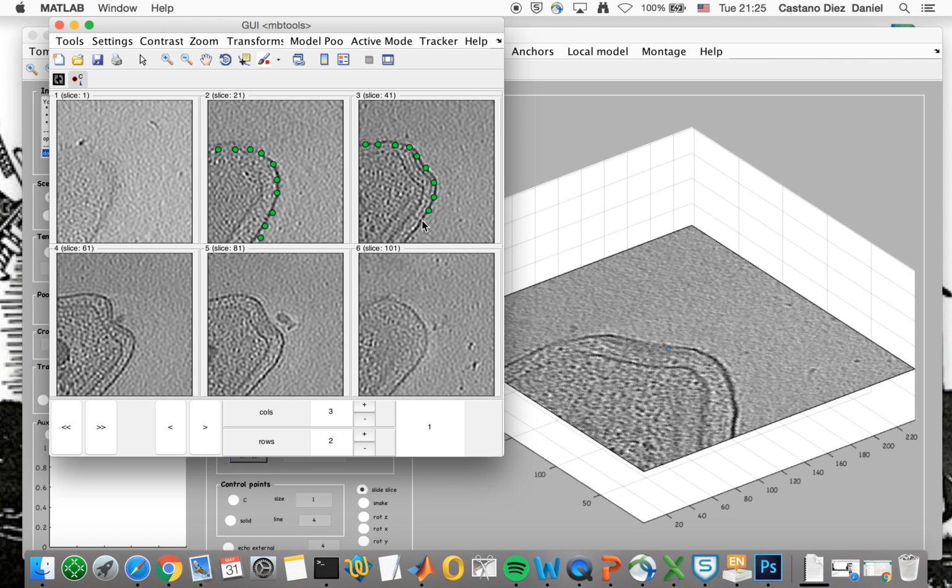We can use a semi-automatic method to track the particles from slice to slice, but that's a very small tomogram. We're probably better off just clicking the particles. Well, this particle here should be moved with M. If you want to delete your last particle, I think you just can click on D and it will disappear, or any other particle, not just the last one.